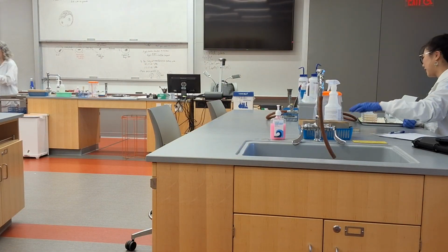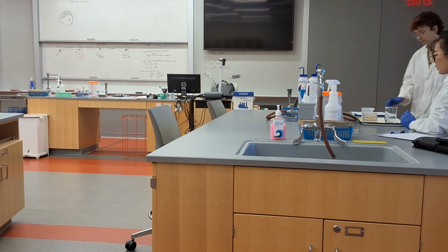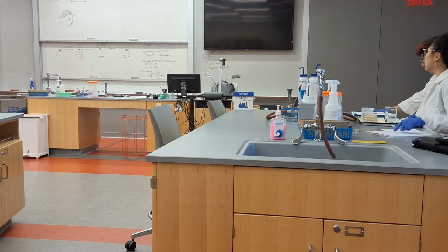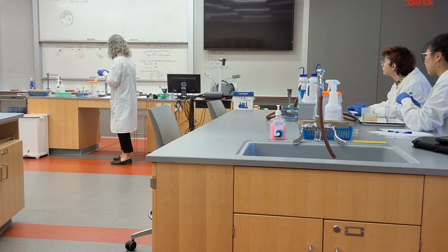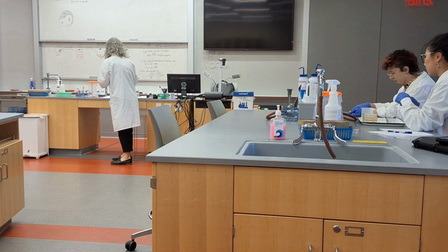Okay, so you mark one plus, mark the other minus. You can put your initials, drawing or what have you on the tubes to mark it as yours. Then open one of the transfer pipettes to get familiar with the volume. You have a little drawing on the side of the book, right?